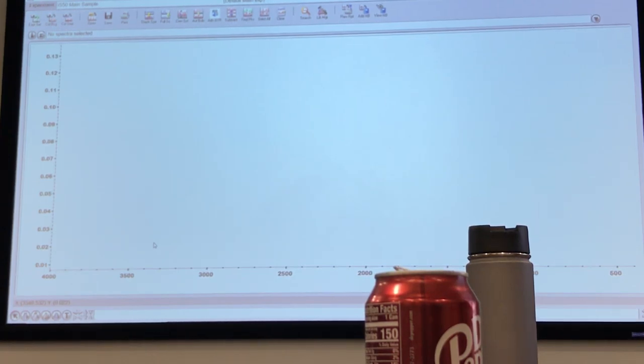I think that's exactly right. I think it depends on what the question is. Right now, there's been a big explosion in air quality of these cheap sensors to detect particulate matter, and the traditional air quality chemists say these things overestimate particle size, and so on. But in reality, thousands of these units have been sold. The resolution isn't super exact, right? We don't know exact particle amounts, but what you gain in terms of massive sample size, you can see fires burning, you can see all this kind of stuff. So I think it really matters what the question is.